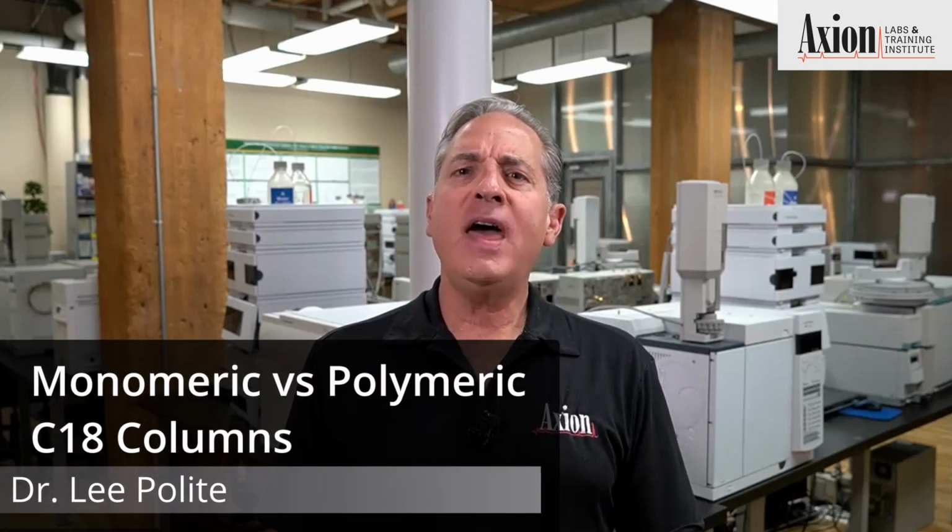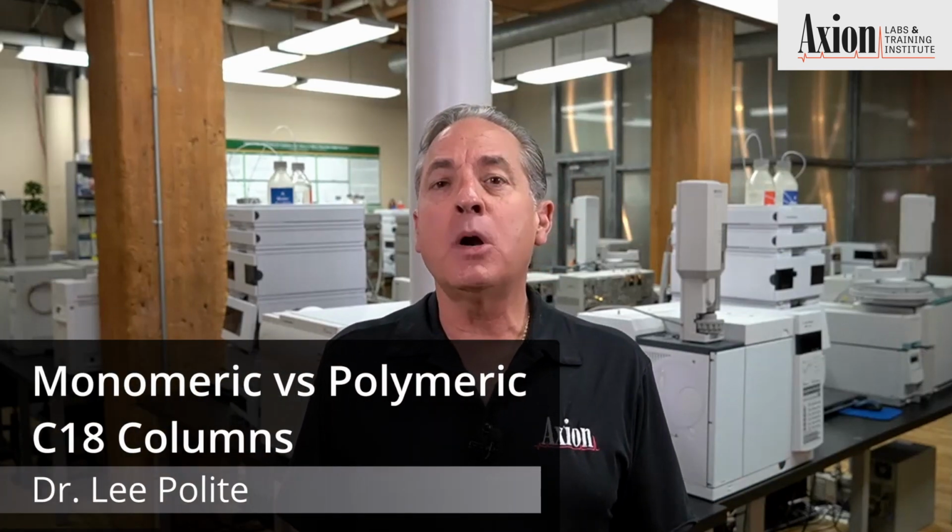And now we're going to talk about a little more obscure topic, but people ask about monomeric versus polymeric C18s. So it's getting into the nitty gritty of columns, but just about every C18 column that we're using is a monomeric, which means the C18s are floating around, doing their own thing, happy as can be. Now we make what's called a polymeric C18, which means that all the C18s are holding hands. It's cross-linked, and it forms a very stiff stationary phase.